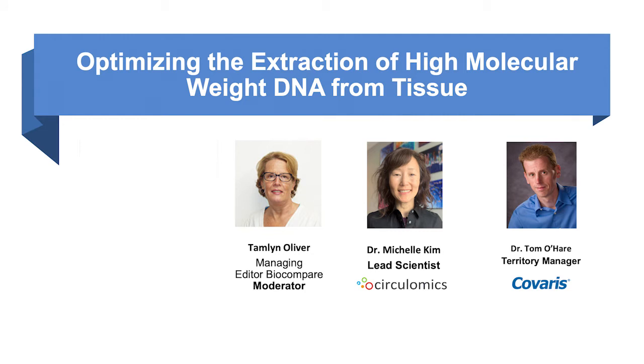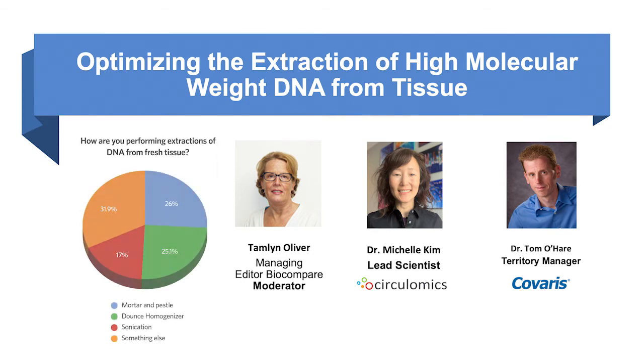Thank you, Tom and Michelle, for those informative presentations. Before we start our Q&A session, we have a few polling questions to gauge where you are with DNA extraction. So bear with me a minute while I get those up. Okay, so the first question is, how are you performing extractions of DNA from fresh tissue? Mortar and pestle, Dounce homogenizer, sonication, or something else? I'm going to give you a little time to answer that, and then we'll share the results.